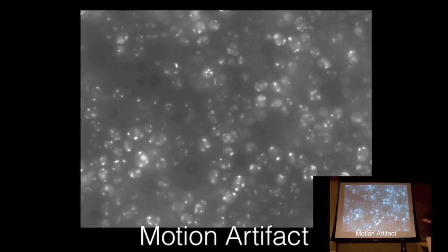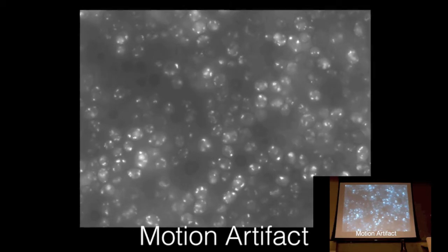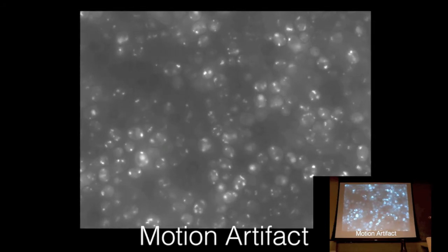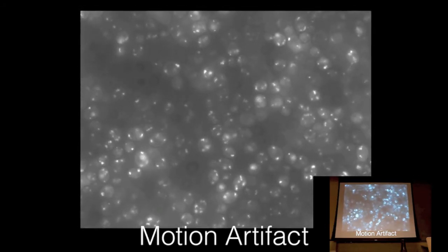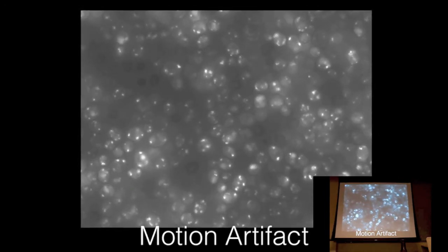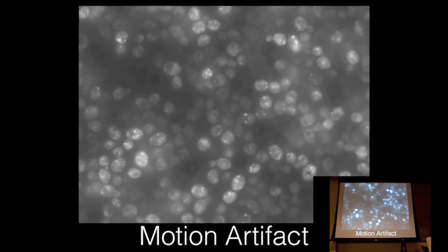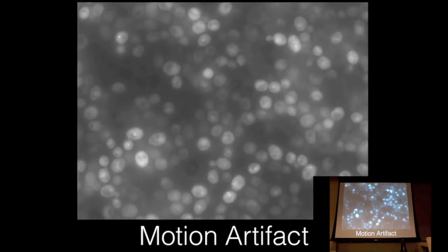So that takes care of most of this motion, except for if you pay really close attention. What you can see here at the beginning of the movie is that all the cells look kind of blurred, and then slowly the puncta become more punctate. I think that's because not only is there XY motion, but there's also Z motion through the movie, and that's probably because, I'm guessing now about your experiment, that you maybe have a heated plate or something.